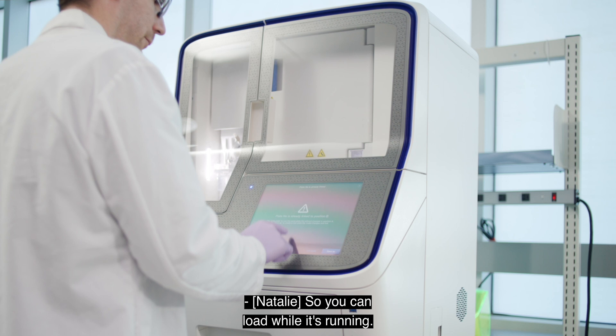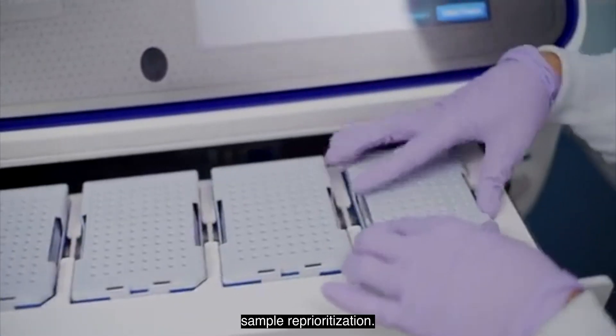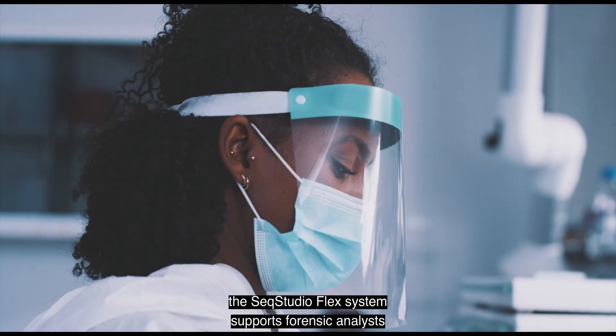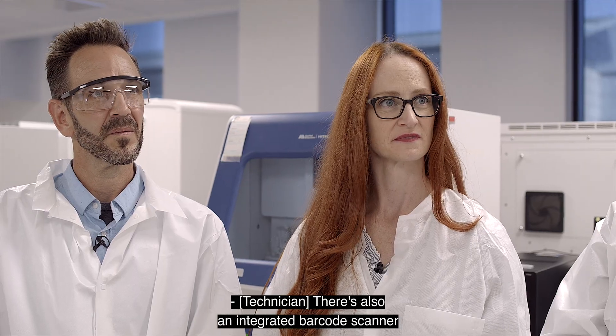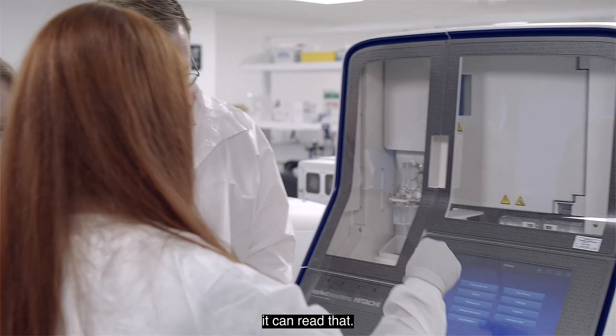So you can load while it's running? Yes. Continuous plate loading, sample reprioritization. Available in both 8 and 24 capillary formats, the SeekStudioFlex system supports forensic analysts with flexibility, usability, and serviceability. There's also an integrated barcode scanner — so if you use barcoded plates, it can read that.